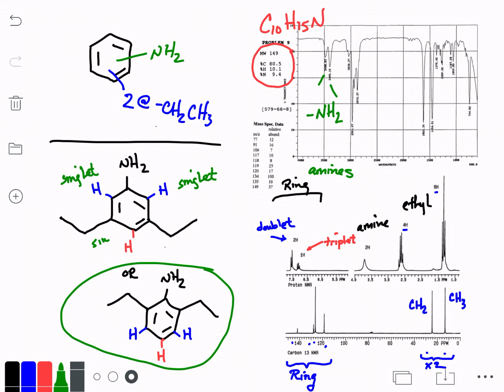If I had had the structure up above, then all three of these hydrogens would have shown up as singlets because they don't have any neighboring hydrogens. The shifts probably would have been a little bit different, but the really key indicator is that doublet triplet pairing. It's the same thing when I looked at the ethyl group that told me that this altogether was involving an ethyl group.